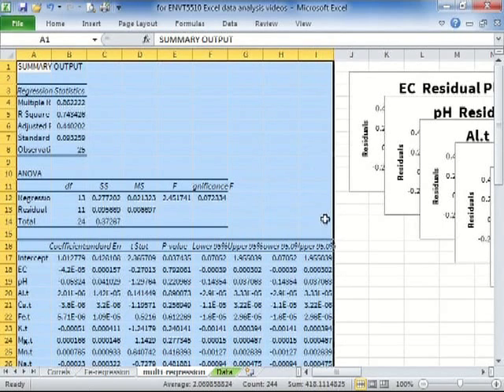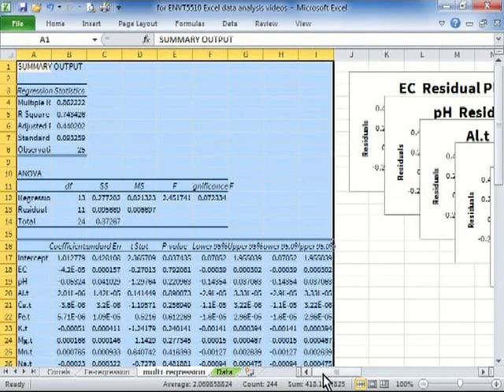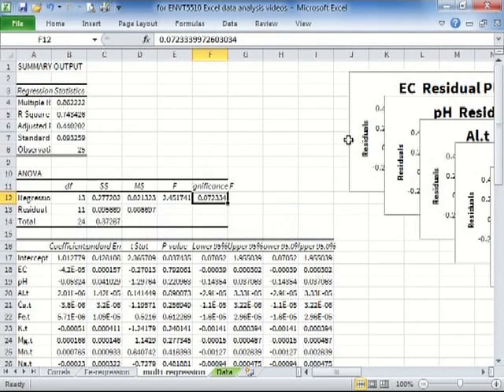Okay, so here we get one. I'm going to produce way too many graphs, so I'm not even going to look at those. But now we've got a much more complicated result. Okay, so what's interesting here is that the significance of the relationship, so the p-value, which is not a measure of how good our model is, the R² value is, so don't worry about that.